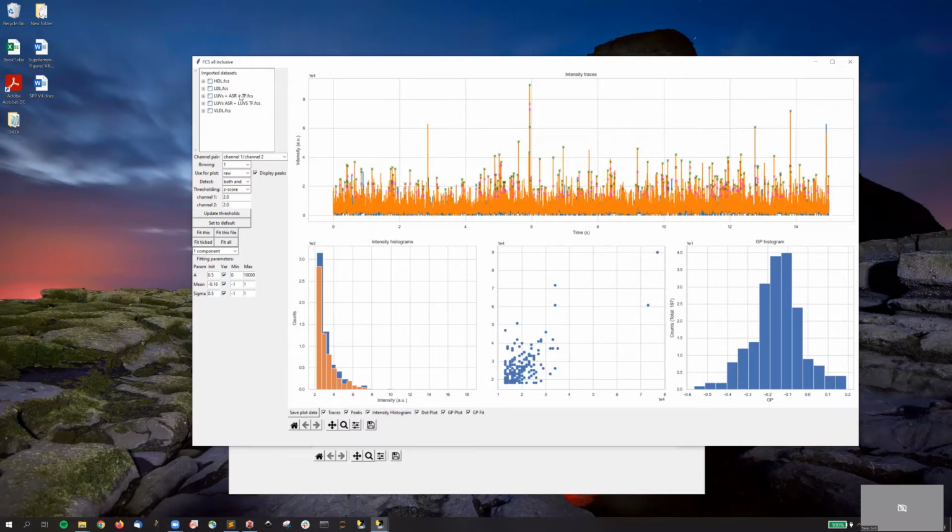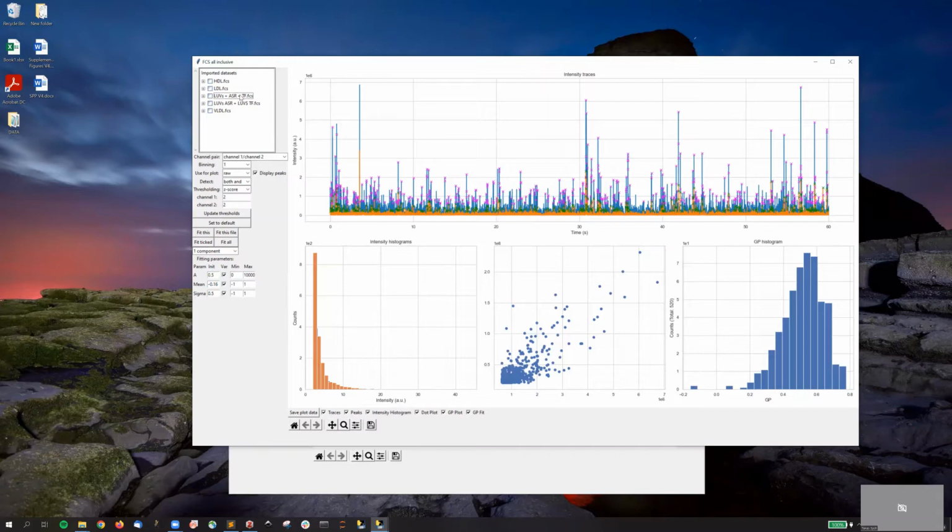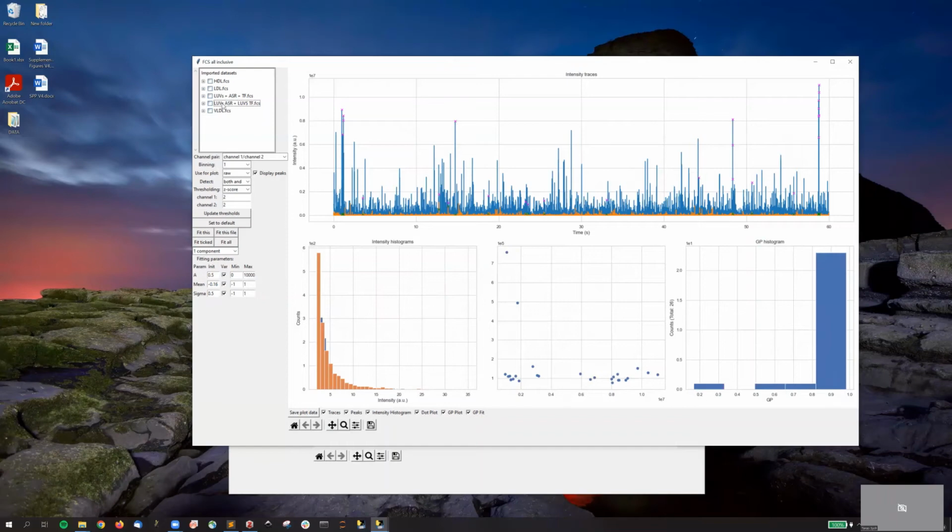For that, I prepared two types of files. They contain data from liposomes that were loaded with two types of dyes, like over here, LUVs, liposomes with Abberior Star Red and TopFluor cholesterol. These are two types of dye in each liposome. And this other data was from a mixture of two types of liposomes that are loaded only with a single dye. Let's see which types of dot plot would be yielded from these two types of data.